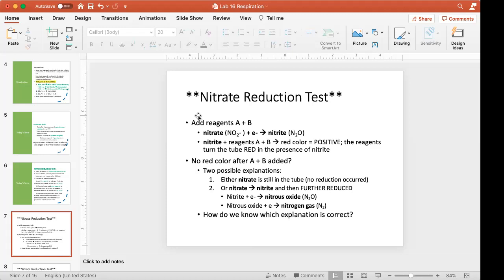When we take it out of the incubator, the first thing we're going to add is those 2 reagents. Now, I'm not asking you to learn the chemical names of these reagents because nobody learns this. Everybody in microbiology labs just calls these A and B or 1 and 2. So I'm going to add those 2 reagents into the tube.